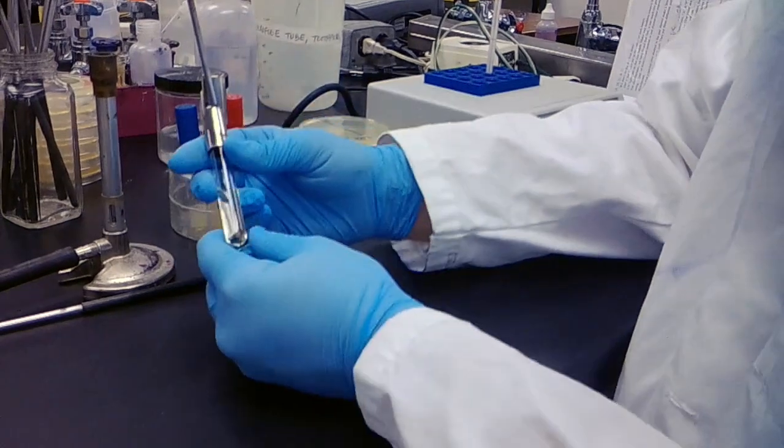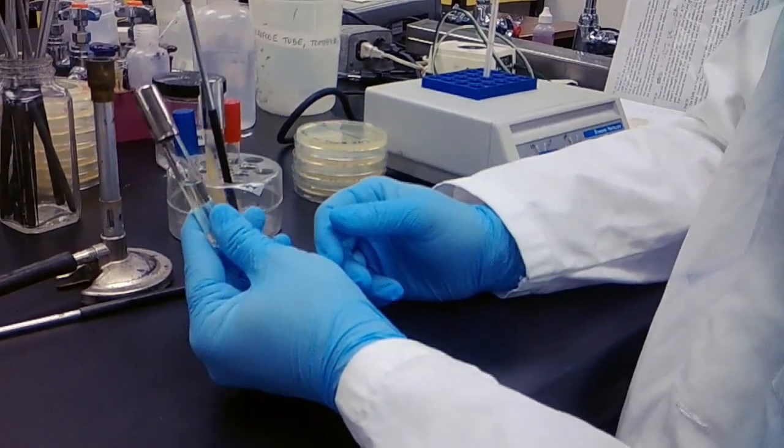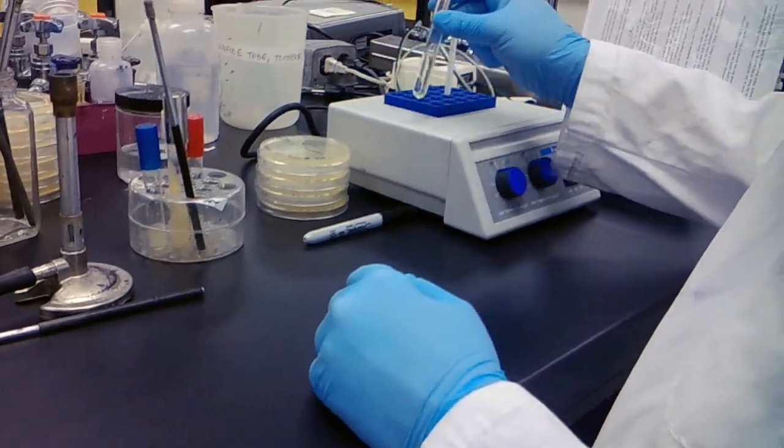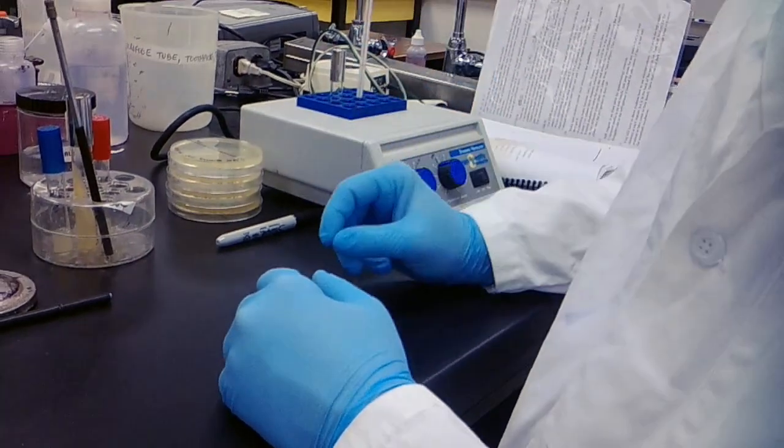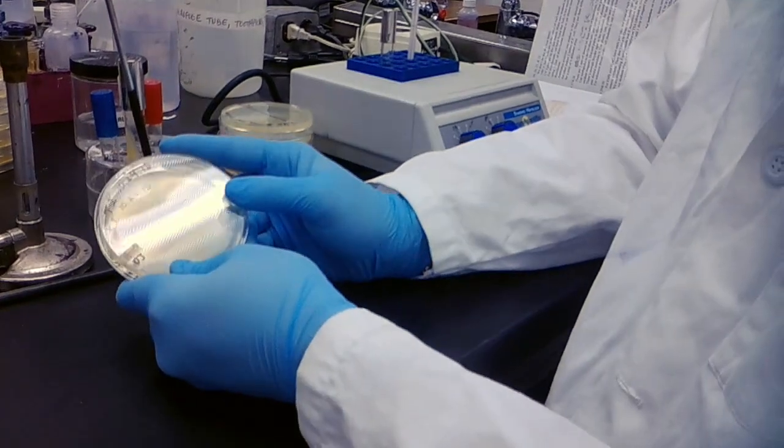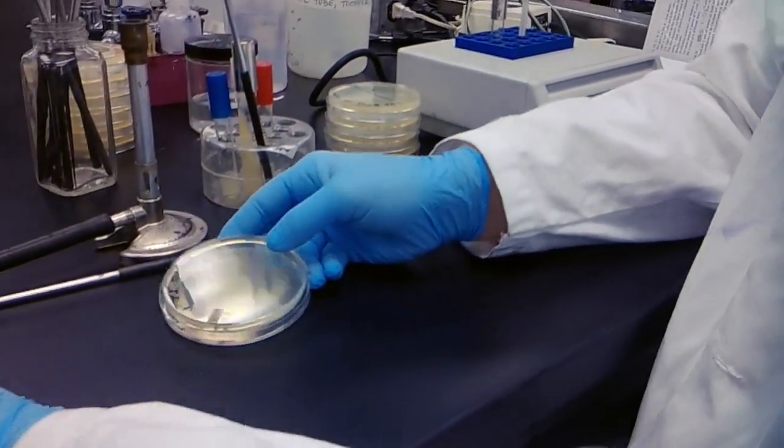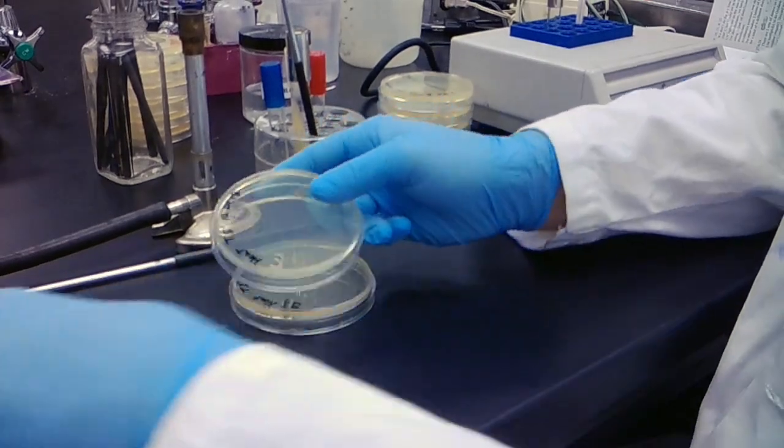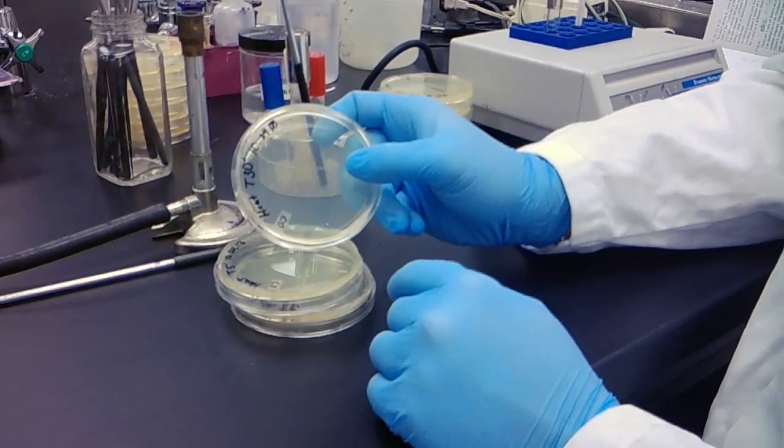Now we're going to put our mixed culture into our heat block and wait one minute, then we will spread for isolation on our T1 plate. We'll repeat this for our five minute time point and our 30 minute time point.